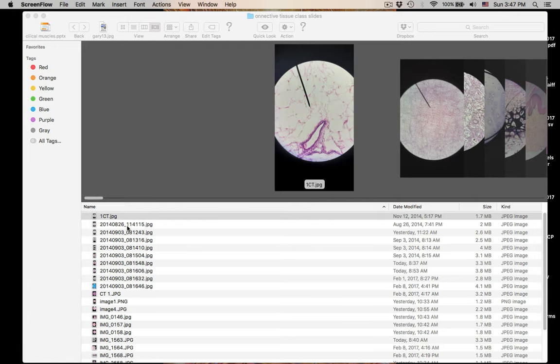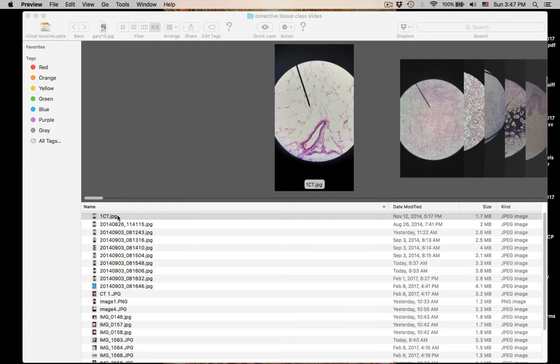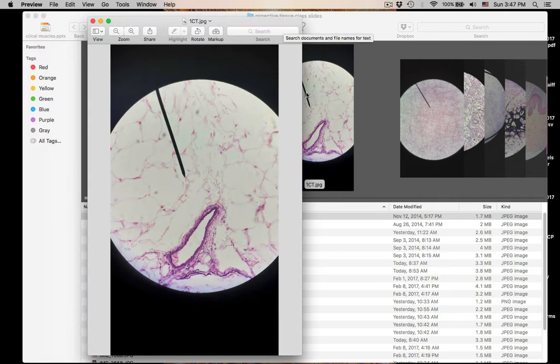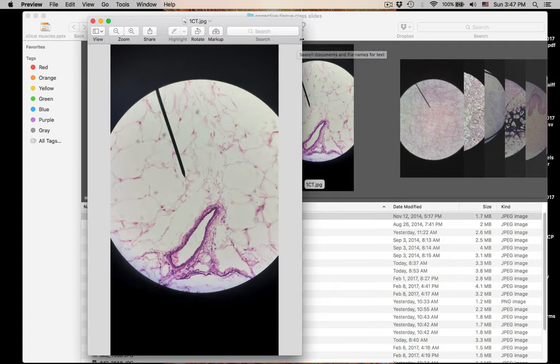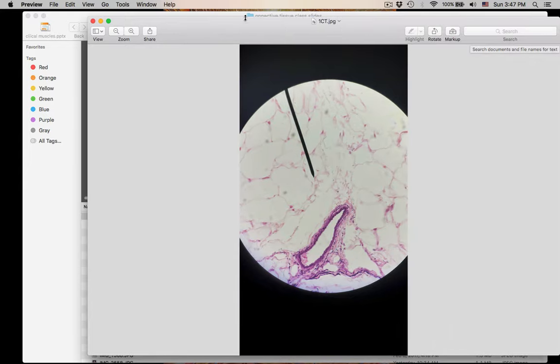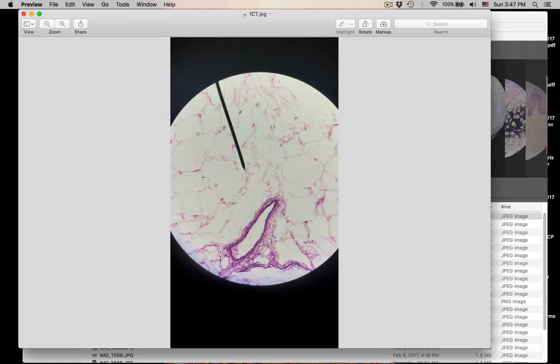Number one: our first connective tissue is going to be this. It might be a little hard to see. Connective tissue has no lumen, so what do you see? What is this connective tissue?